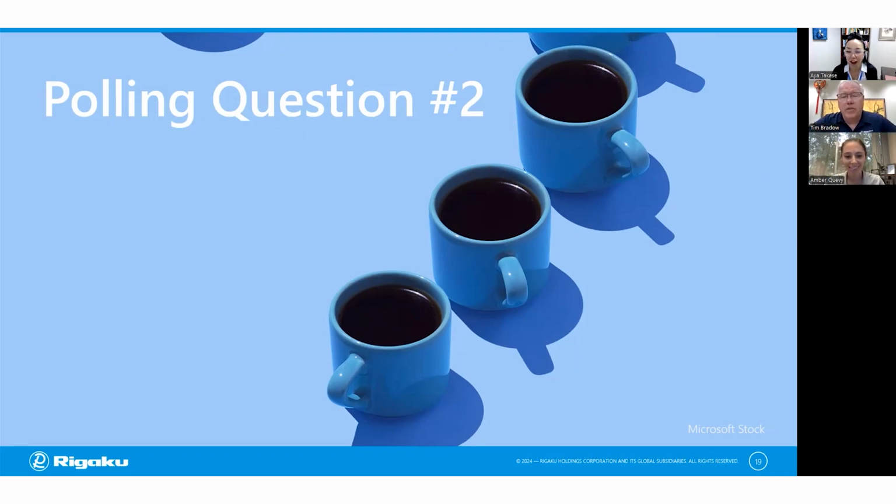Amber, we also have a question from the audience when you're ready. Oh, perfect. Yeah, we can take questions now. Which XRF should I use for battery analysis? So that's going to depend on what the need is. We've talked about energy dispersive versus wavelength dispersive.